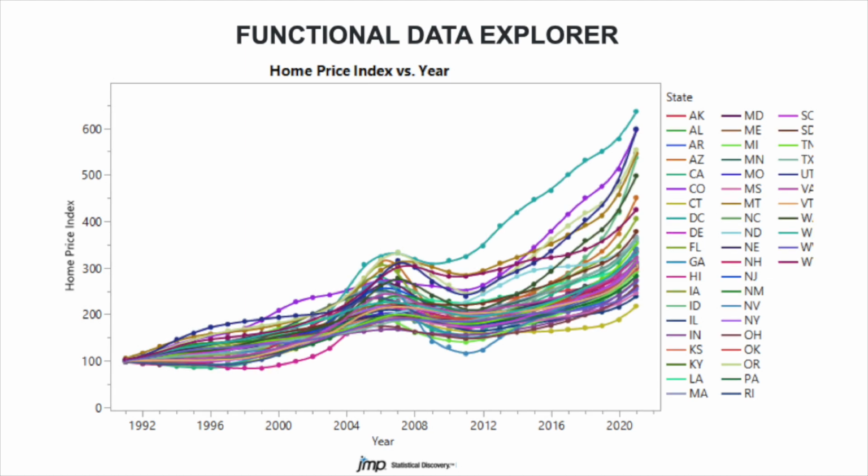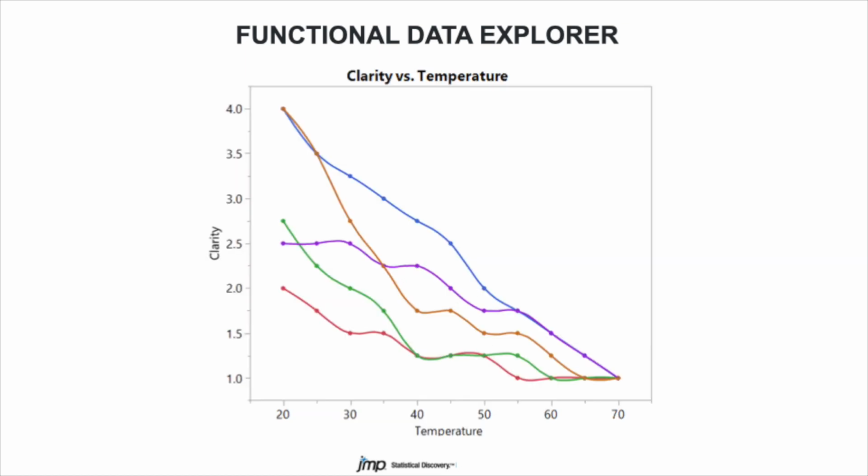What we typically do once we have the discrete measurements is take them and convert them into a surrogate function to turn these into continuous functions. And we have a variety of different strategies for doing that. Then the functional data analysis really operates on the surrogate functions as opposed to the discrete measurements once we obtain those.